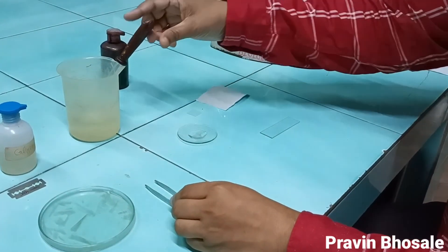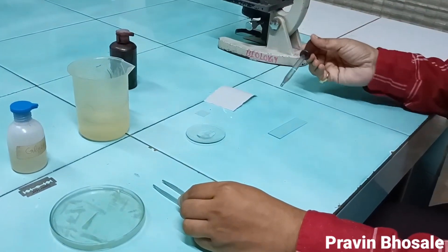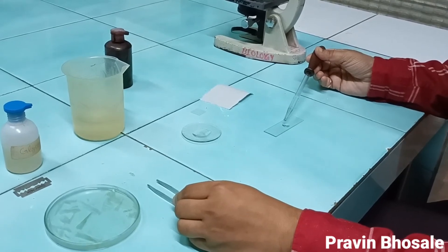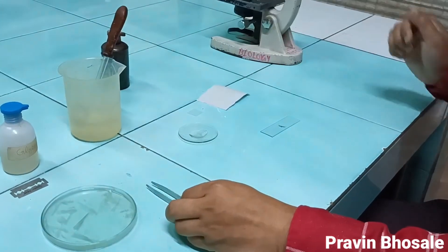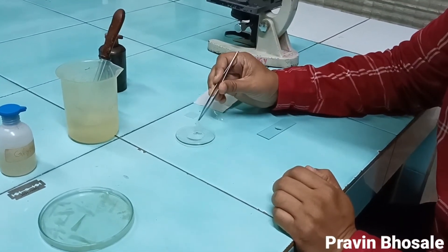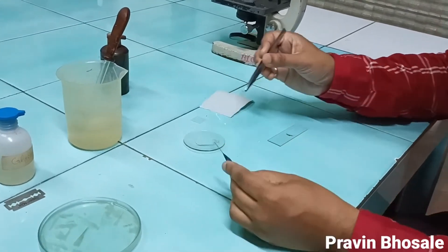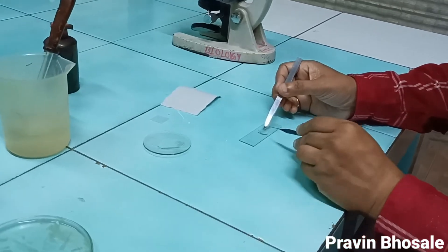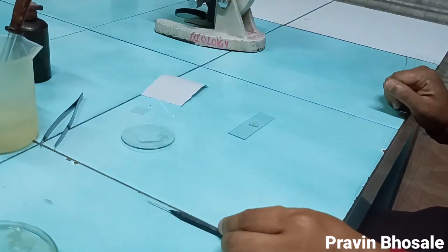Then take a slide. To this slide, add an adequate amount of hypertonic solution — I have taken two drops of hypertonic solution. Now transfer the onion peel from the watch glass onto the slide. I've taken the onion peel on the slide.